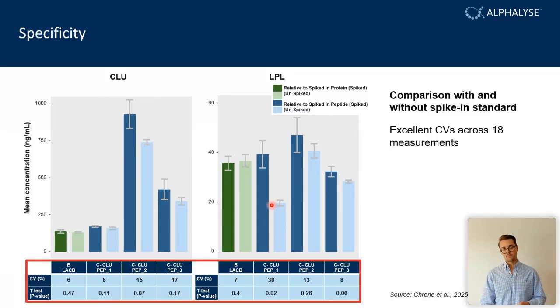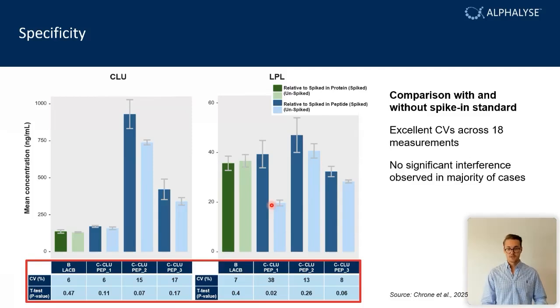But overall, it's essential to ensure that results are not affected by reference standards used. So for that specific reason, we run client samples just to be safe, with and without a spiked-in standard, to ensure that there's no interference from our standards. And again, the targeted approach achieved complementary results.